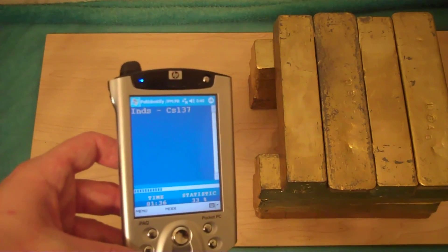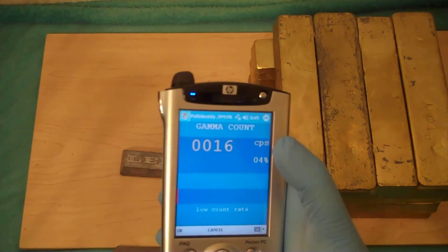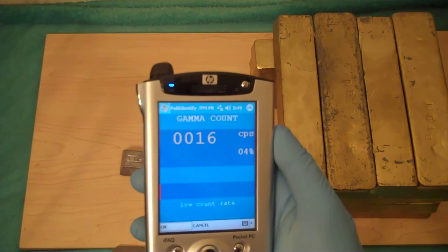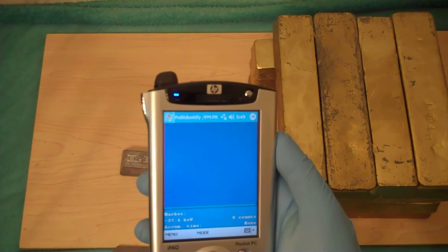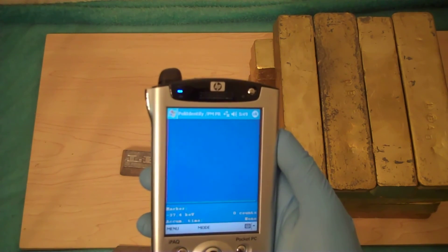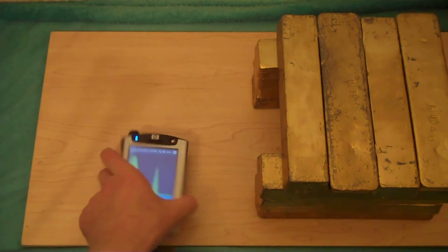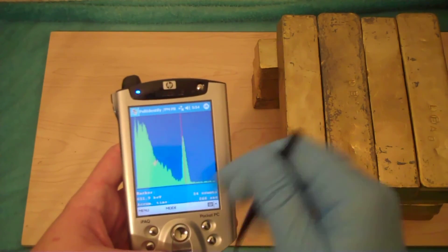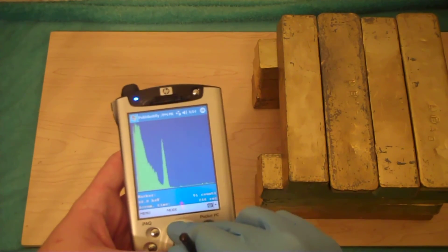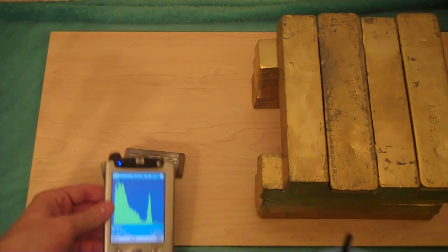Did this can of fish come from Fukushima? Let's do an actual gamma spectrum. If you want to get hardcore, you can look yourself and see what's going on — that's even more useful if you're a little more seasoned at this. There you can see it — the obvious Caesium-137 peak. Give it a couple of moments. You see that peak right there? Caesium-137. Obviously this is fish that's not good to eat. You don't want to eat anything with that much Caesium-137, or for that matter any. You're always going to get a little bit from fish in the Pacific, but look at that peak — beautiful. Well, not beautiful in your food.